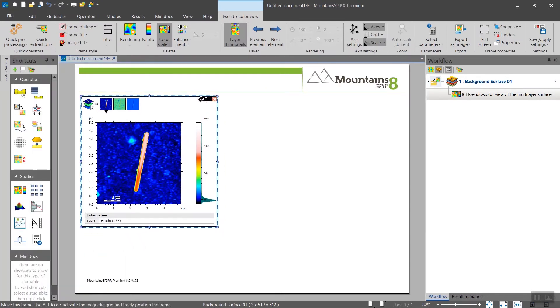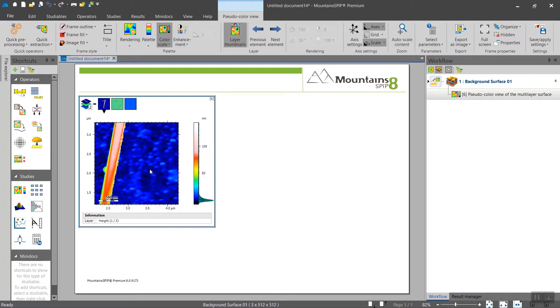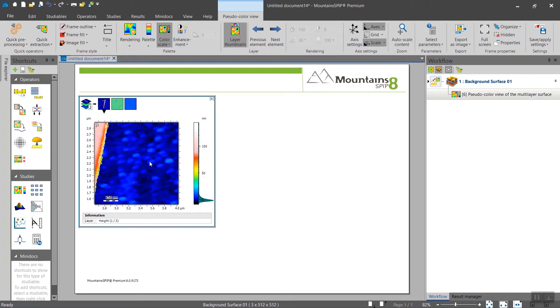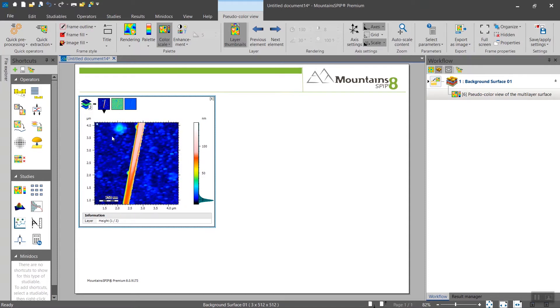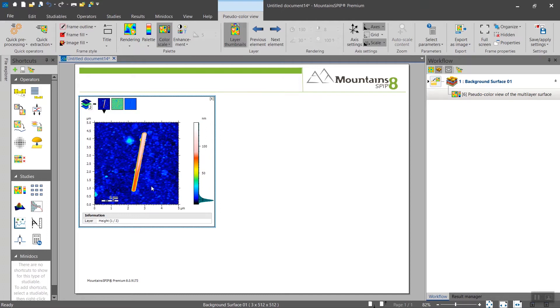You have a tube on your surface, and if you zoom in you have lots of more or less aggregated particles. You might want to remove the tube and perform another particle analysis on the background and only the background.